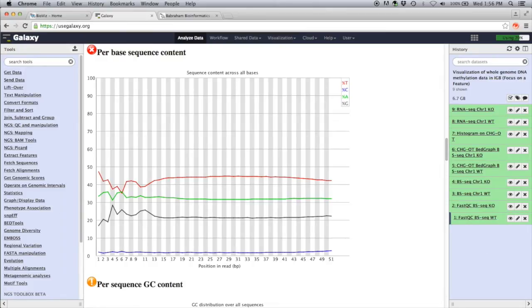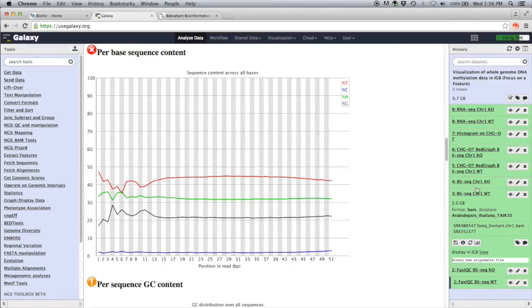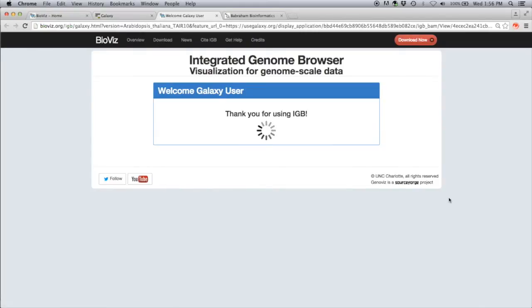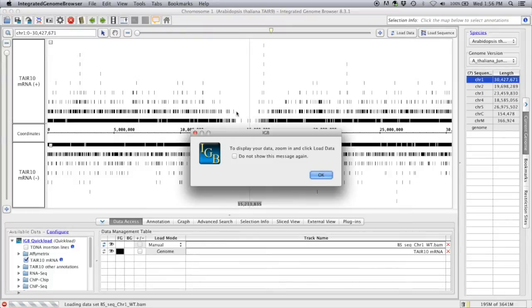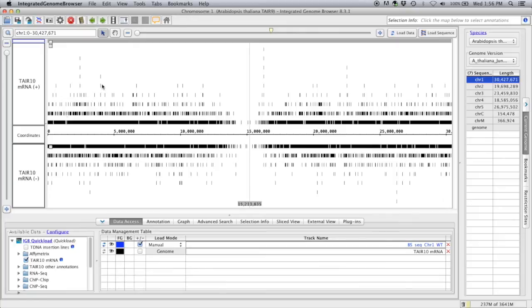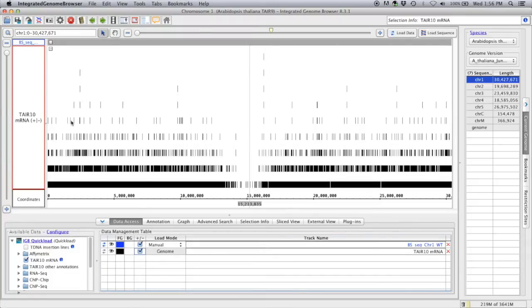Now that we know our reads are good, the first two steps in Bismarck create the bisulfite-converted genome and align our reads to it, producing a BAM file. Click on the BSCCHR1 wild type BAM file and click on display in IGB. As long as IGB is installed and running, it will automatically load into the correct genome. Accept the certificate and load the data. I'll simplify the view by clicking on the Tair10 mRNA track and putting the positive and minus strand into one track. The BAM file is about 2 GB, so we don't want to load all of it over the internet — we'll need to zoom into a gene or region of interest.